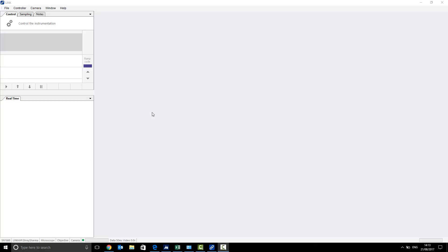Okay, once you've prepared your sample and are ready to do a DSC run, this is how you would set it up on Link.